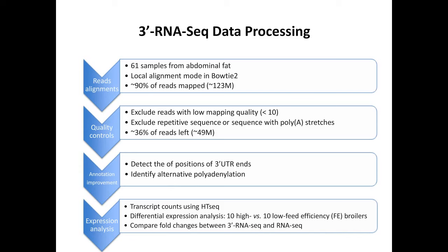This has been studied before, in a published paper where high feed efficiency was compared with low feed efficiency chickens. So we used the same data set to do the same thing with 3' RNA sequencing and to find out how high the correlation is between these two technologies.